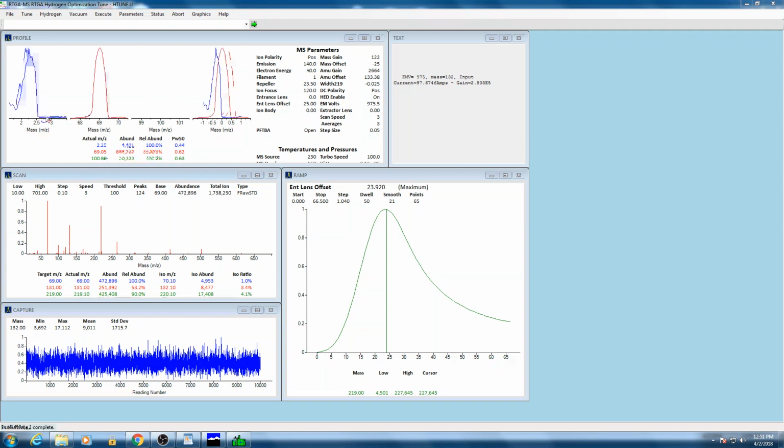And so you can see again that we do get a peak at 2.2 for hydrogen, but every now and then that peak will disappear and we'll just have a peak at 0. When we try to measure hydrogen, we adjust our calibration curve for this appropriately. And if you have an issue where you don't see any peaks at 2.2, you can just increase the pressure on that hydrogen argon regulator to increase the sample flow a bit.